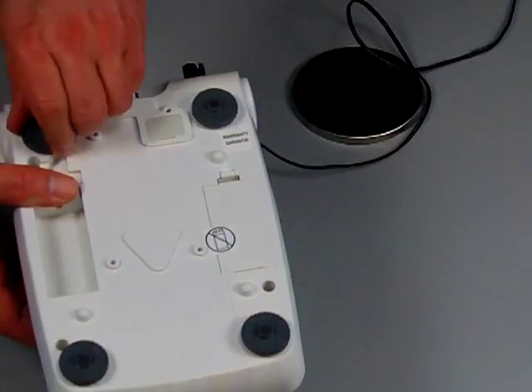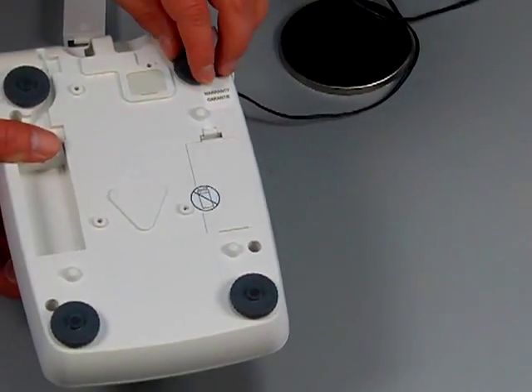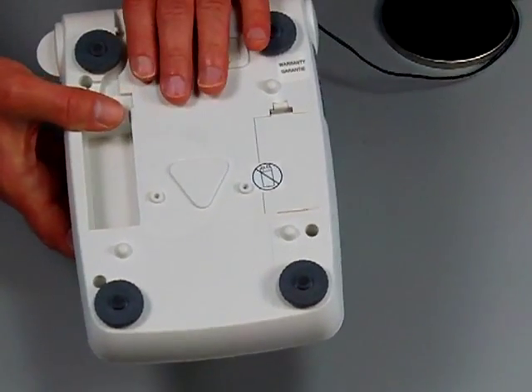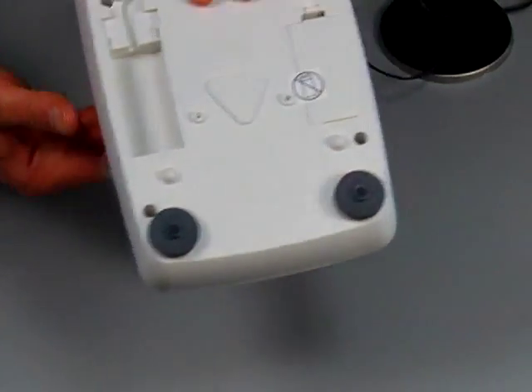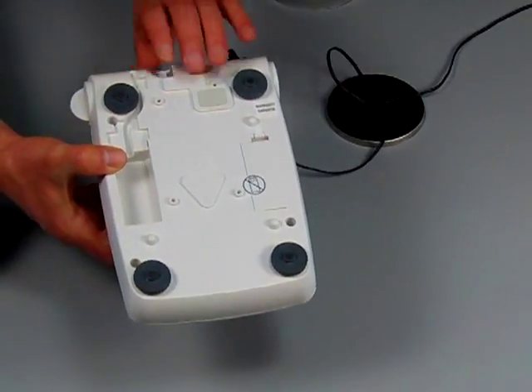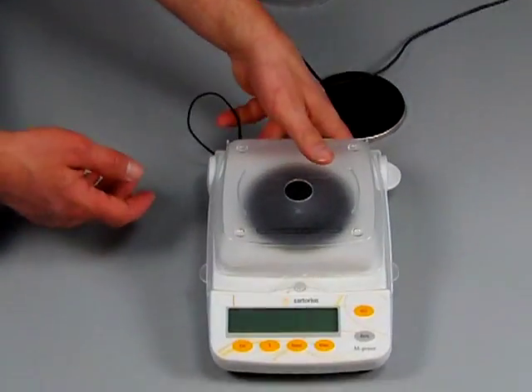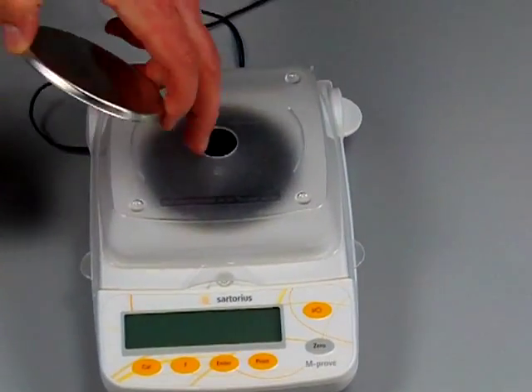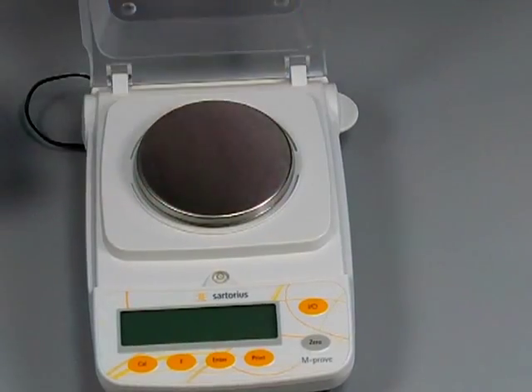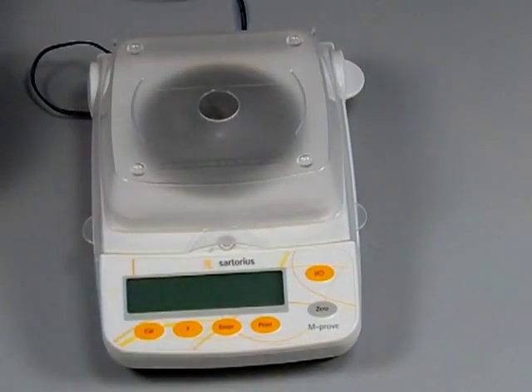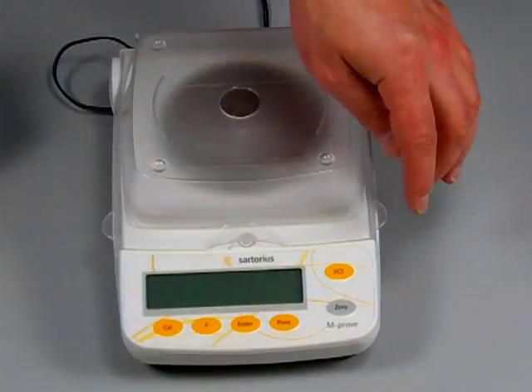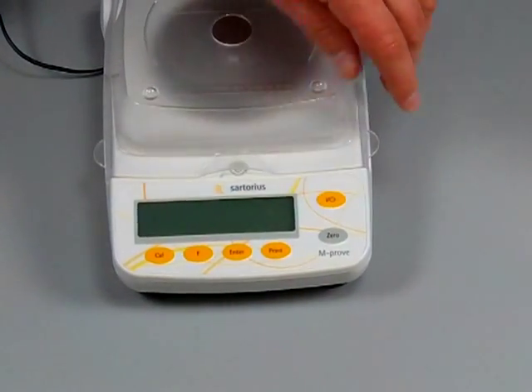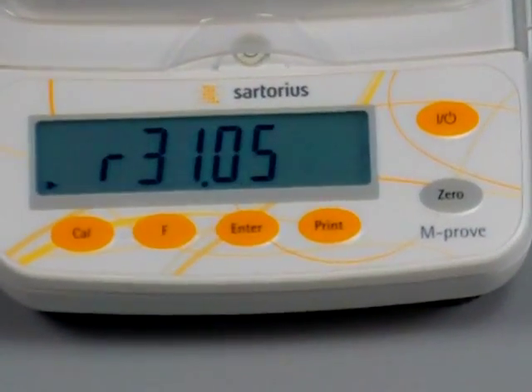Again, this scale does have four adjustable feet. So I guess the Vicon series did not have the adjustable feet. This is a nicer feature, but is it worth the price increase? Well, it doesn't matter whether it is or it isn't, Sartorius raised the price. There's nothing we can do about it. So this scale does come with the AC adapter. We have the scale plugged in and we'd just like to turn on the scale to show you the backlight display. It probably won't show up with the light in here, but anyways the scale powers up.